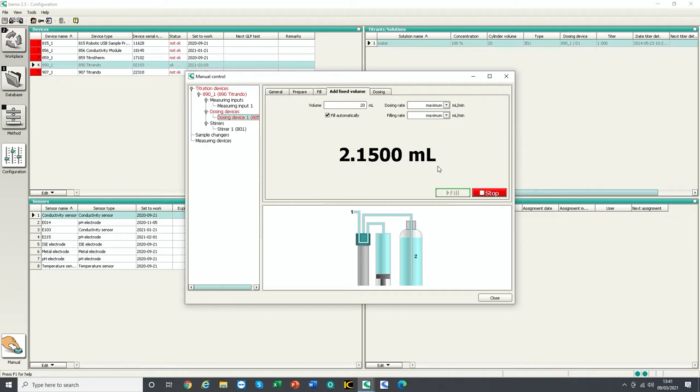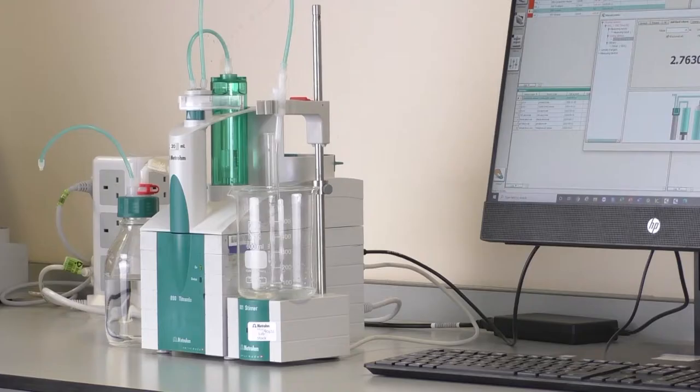Again allow the buret to automatically refill as this will move the piston to the bottom of the cylinder, the zero position.